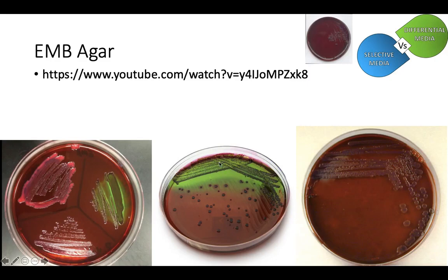And that is characteristic of E. coli. They are the only species that can do this for our purposes. And if you see that green shimmer, you have E. coli, no matter what else grows around it or on it. If you see the green shimmer, it is E. coli. And this is why dairy industries and food industries use it, because it's so easy to tell apart E. coli. All the rest of the gram negatives, if you can ferment the lactose, will uptake eosin. And eosin gives them this purple color, either kind of a pinkish version, depending on how much eosin they uptake, or a really dark purple. It just kind of depends.